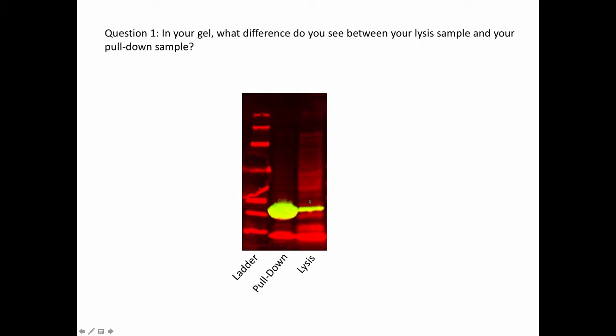The red channel, the revert total protein stain, is showing you all the proteins, and the green channel is showing you the antibody detecting GST. What you see is a green band because obviously those bacteria were making GST. This is the benefit of a Western blot: in a total protein lysate when you have thousands of proteins that look very fuzzy and non-distinct, you can use a protein-specific antibody to detect a single protein in that lysate.